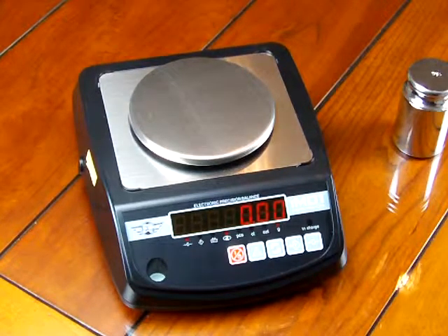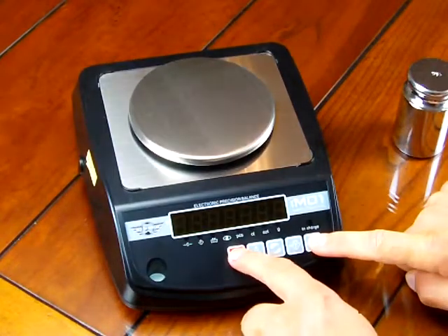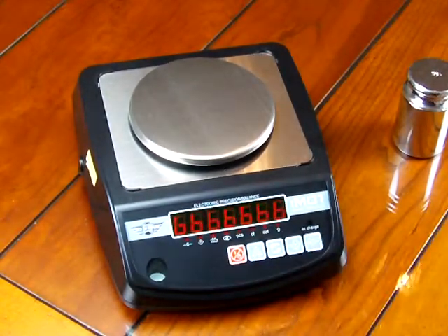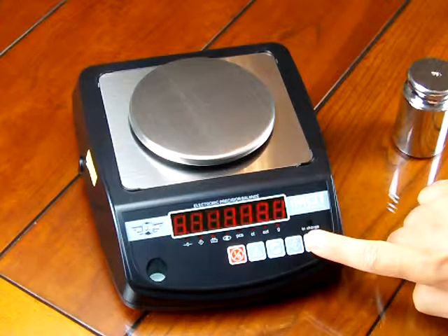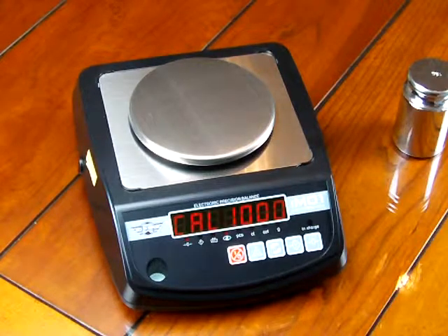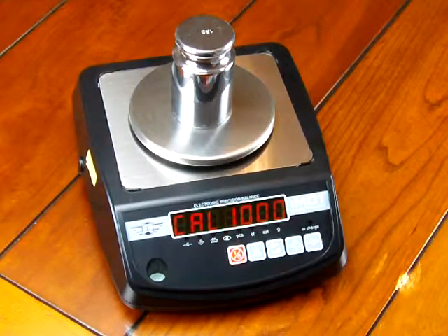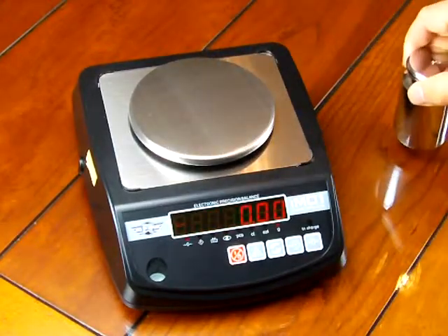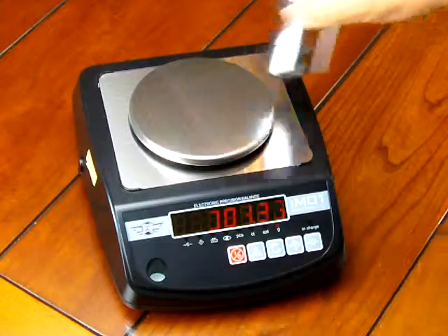Let's go through the calibration. You have to have the scale off. To calibrate it, we're going to press the tare key and hold that down while pressing the on key. You'll notice it says Cal Zero and then Cal 1000, so we need a 1,000 gram calibration weight. We'll put that on the center of the platform. It shows a thousand and the calibration is done. If we take off the cal weight and put the calibration mass back on, you can see it's right on the money. Calibration is a cinch.